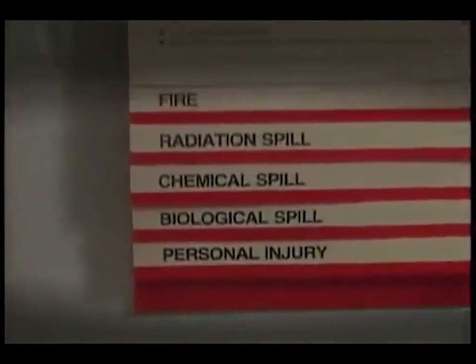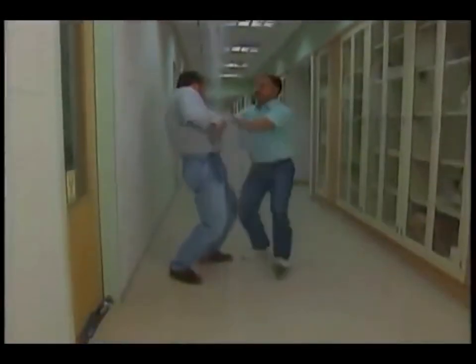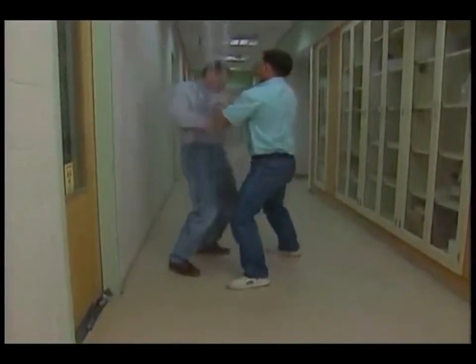What do you do if you or someone else is injured? Chris, help! Chris, I spilled chemicals. Chris, Scott, what happened to you? Take your shirt off. Get it off.